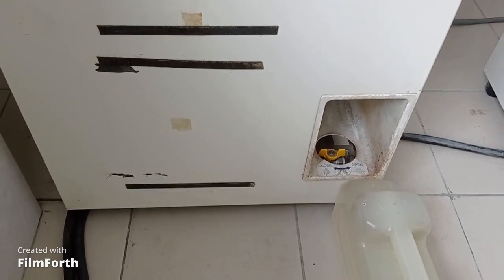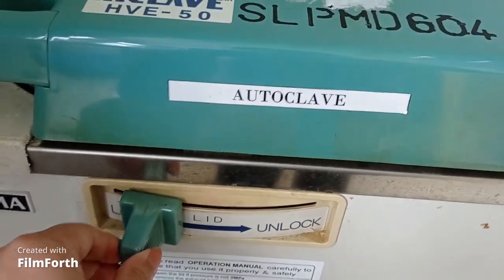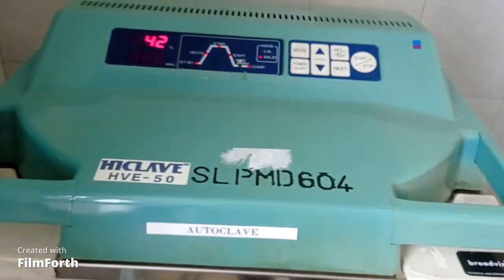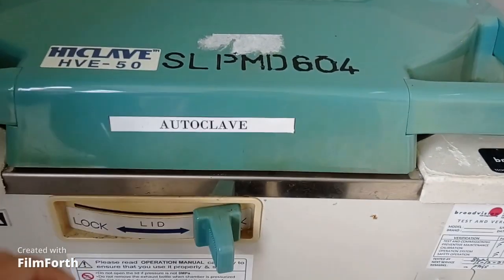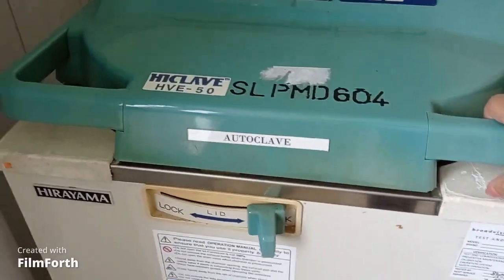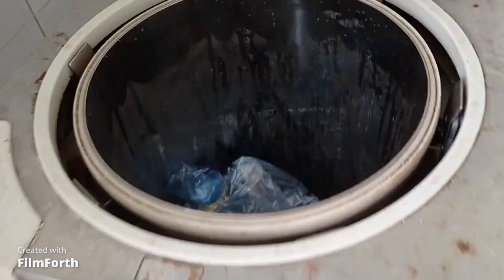After 1 hour and 30 minutes I came back, took out the water cylinder, and unlocked the lid. Now I can open the lid. As you can see from the autoclave tape, you can clearly see that this clinical waste has been sterilized or autoclaved properly.